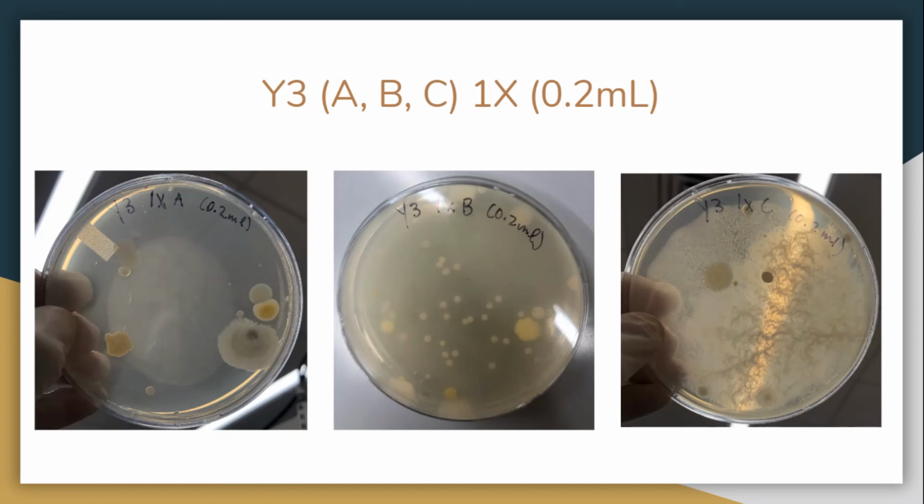The mean colony count for my plates is 111.67, and the standard deviation is 111.39. The large standard deviation suggests that there is a great variability between samples.